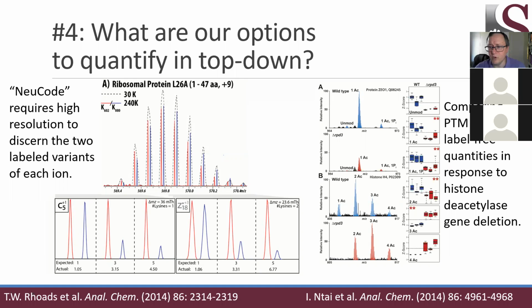So while today's talk is largely about intact protein mass spectrometry, it is possible to put stuff that's not proteins into the instrument as well and get good information back. I would highlight the example of venom proteomics, because a lot of times we see things like antimicrobial peptides secreted by frogs.